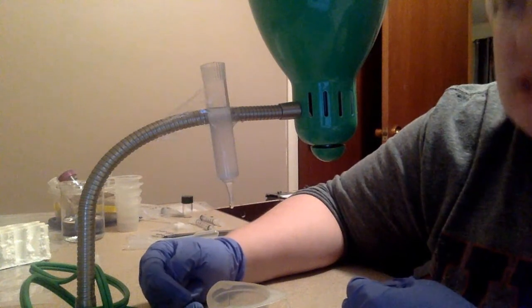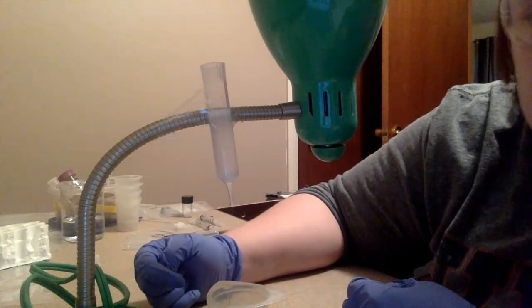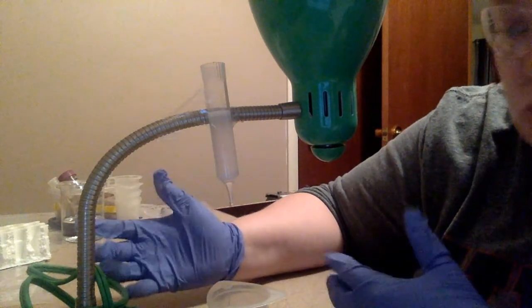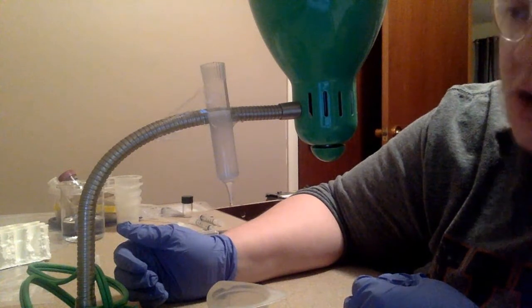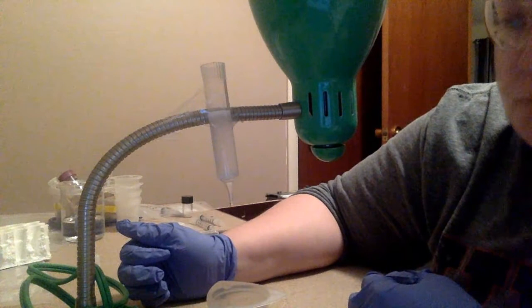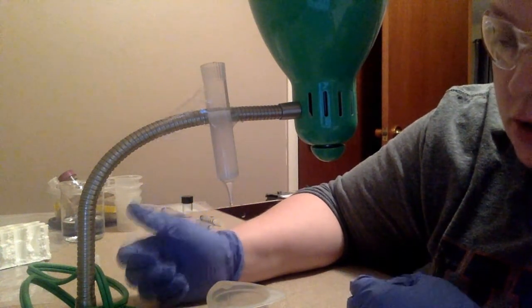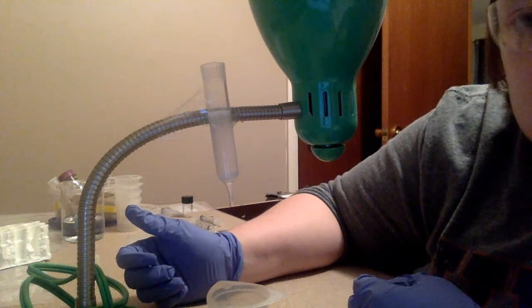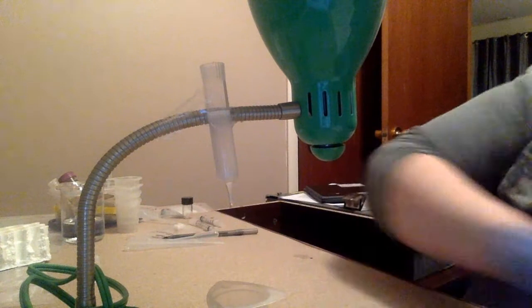What that leads to is the larger molecules going through more quickly, because they're not navigating through the beads. Since they're not navigating through the beads, the large molecules come out first. So the largest component in our unknown is going to be the first thing to come out, whereas the smallest is going to be the last to come out. Alright, so that was step 1.